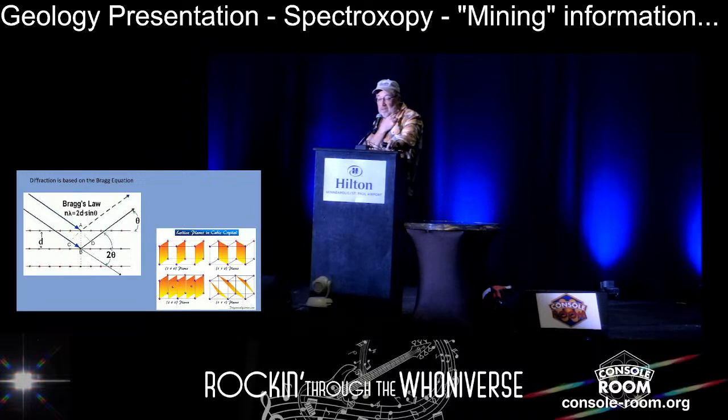in other technologies as well. And lambda is the wavelength; we're using copper K-alpha radiation. We know the wavelength of that. d is the interplanar spacing, 2 times d, and then theta is the angle that we're actually scanning at. And d is the interplanar spacing of a crystalline substance. So if we don't have a crystalline substance, we don't get a diffraction peak.